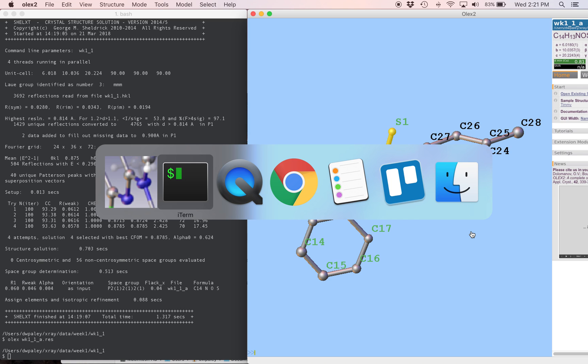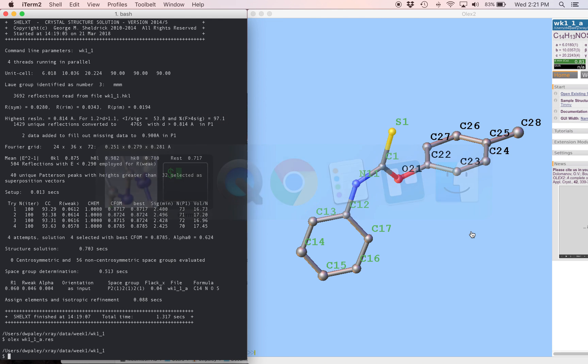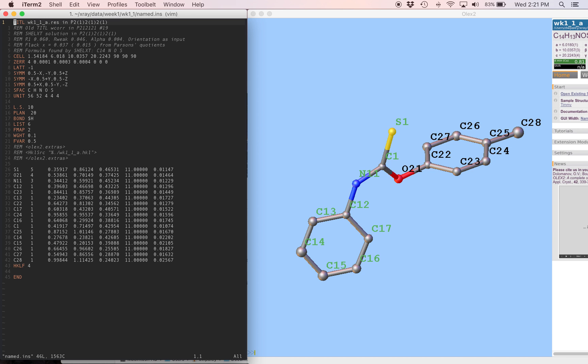We can save a file with these new atom names. Let's call it file named.ins. And come over to our terminal and take a quick look at that file that we just made. I'm going to open this in vim. named.ins.